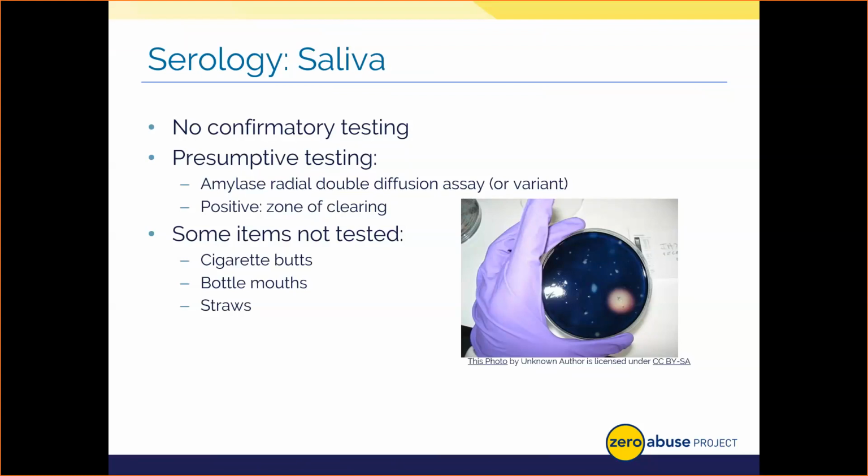Simple sugars lack those large grooves of the starch since it's been chewed up by the amylase, so the iodine's not going to bind to the area of the plate, leaving a positive sample to look like an unstained brown or yellowish zone. This test is called the starch iodine or radial diffusion test for amylase. Note that some labs may use a variant of this method known as the Phadebas method.